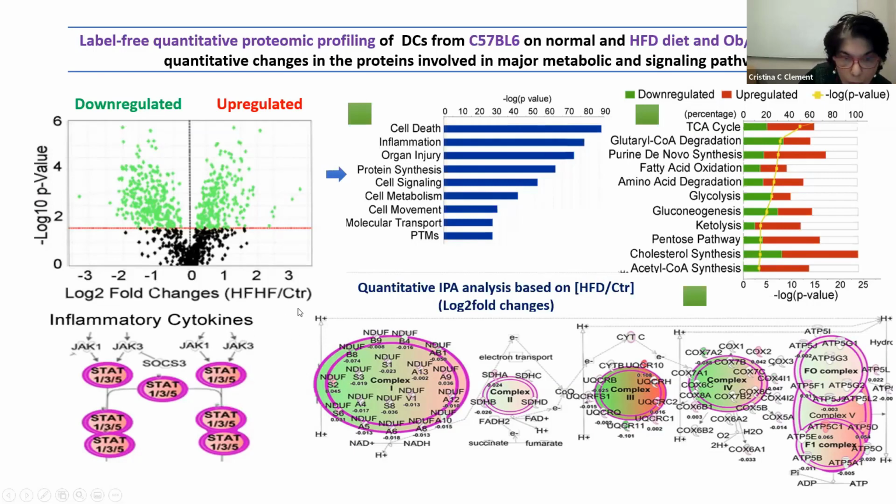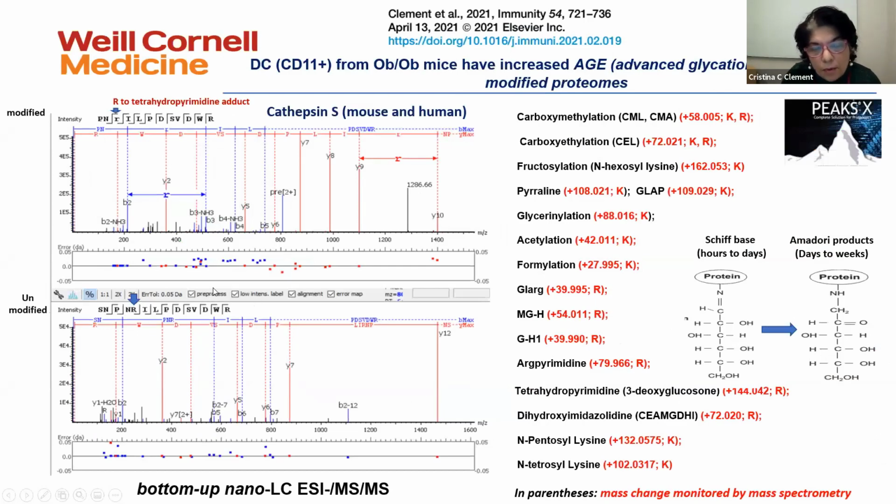So today there were a lot of questions related with post-translational modification. We always use PEAKS to identify the high-resolution post-translational modification. Here you can see which types.